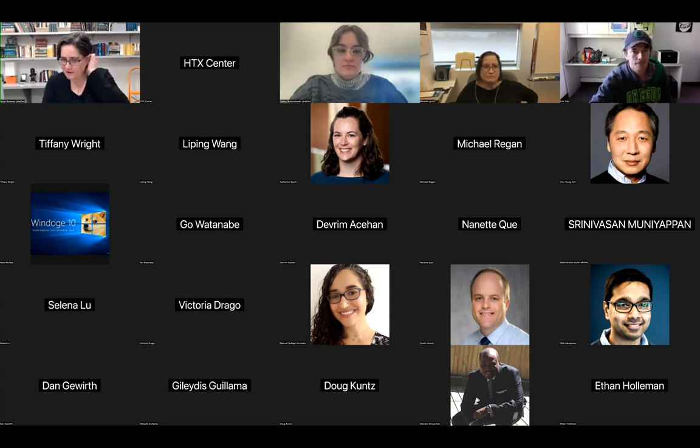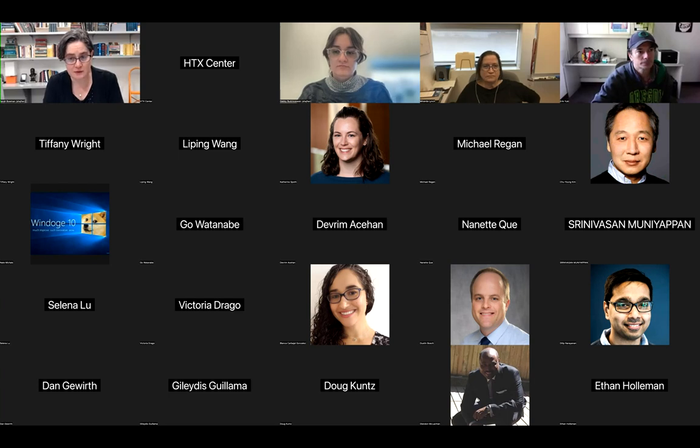That's great. We have a comment from Anwar, which I am going to give a big thumbs up, to also use the pre-crystallization screen or those components from Hampton Research. And that's a good way, especially if you're resource limited, sample limited, to do a quick screen with a couple microliters of your sample to see if the concentration range is good before you send to us. Because then you're much more likely to get good crystal hits from the screening experiment. So, absolutely, Anwar.